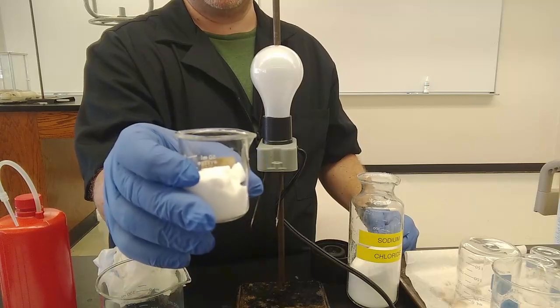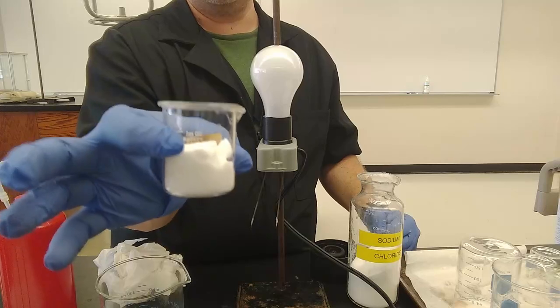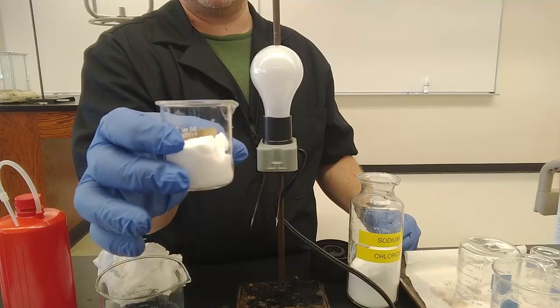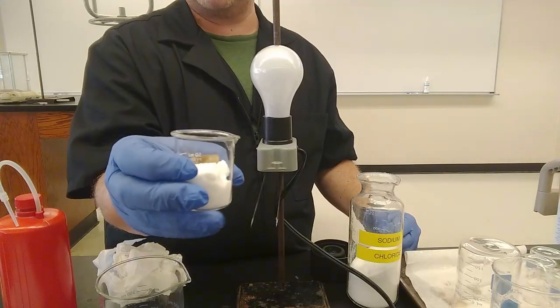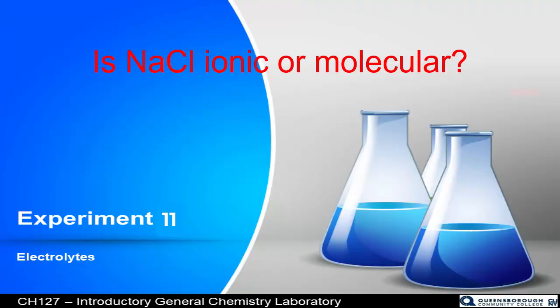Electrolytes, like sports drinks, Gatorade, replace your electrolytes, because when you sweat, you're sweating out salts. You're not sweating out solid salts, you're sweating out solutions of those salts. It's replacing your electrolytes. Okay? We can't decide what this is because it doesn't fit our definition. There may be ions present, you will decide, based on sodium chloride being ionic or molecular.